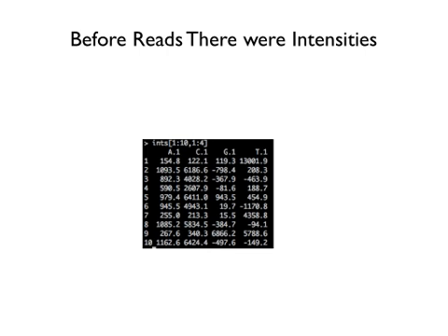What is it? It's a T, right? The second one is, look again, C, right? So it's T, C, C, C, C, C, T, C, and now look at number 9. What is it? Okay, you say G, but it could be a T.